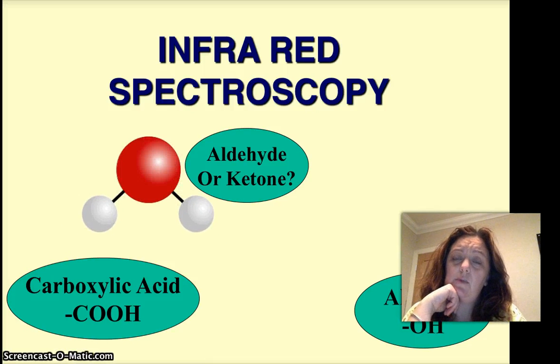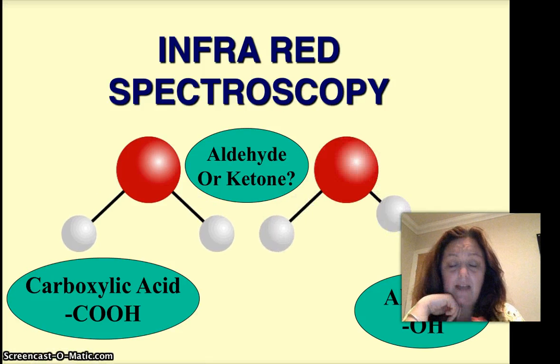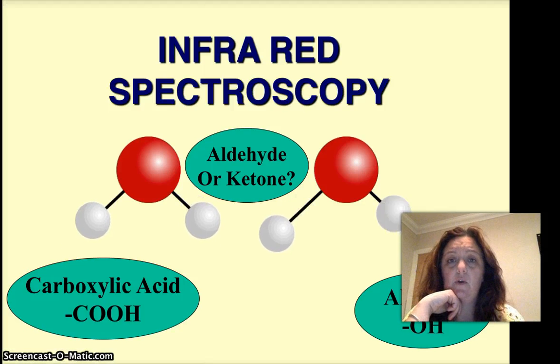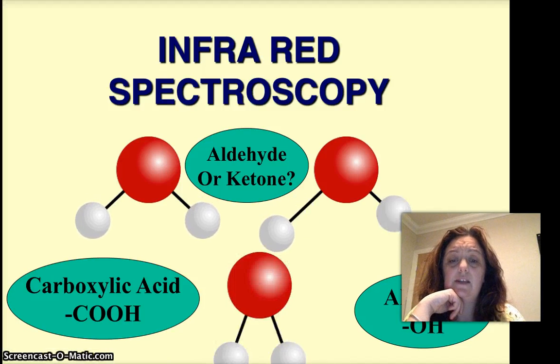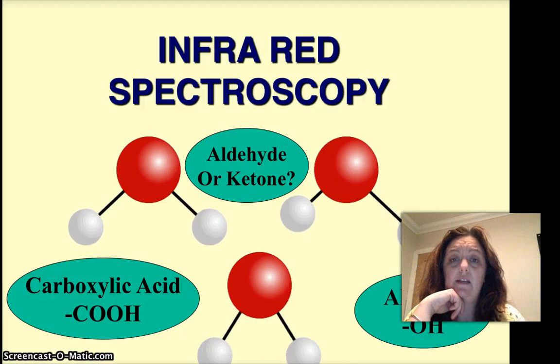Each molecule contains different atoms connected by bonds, and these bonds are constantly vibrating at a particular frequency. That frequency depends on many factors, the atoms involved, the length of the bonds and so on. But the key thing is that the frequency is quite specific to that particular functional group.